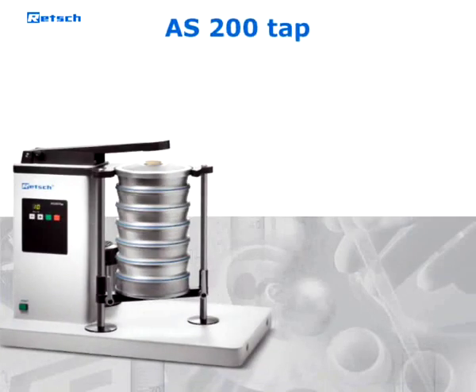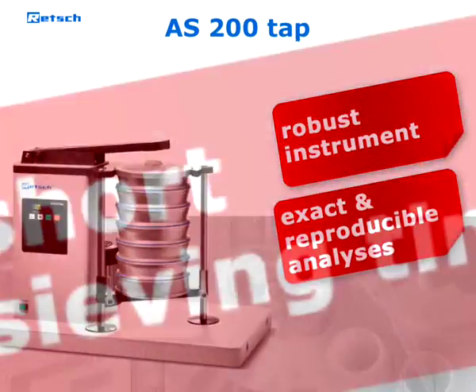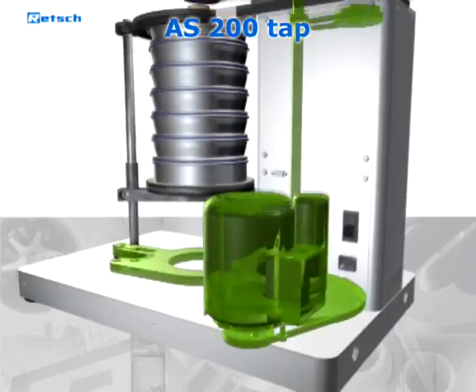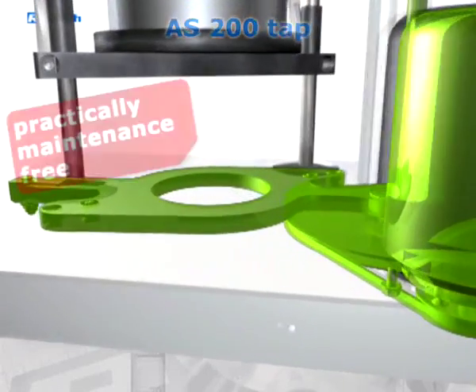The AS200 TAP is a robust instrument for exact and reproducible sieve analyses in a very short time. Unlike those of other tap sieve shakers, the robust and powerful drive designed and manufactured by RETCH is almost maintenance-free.